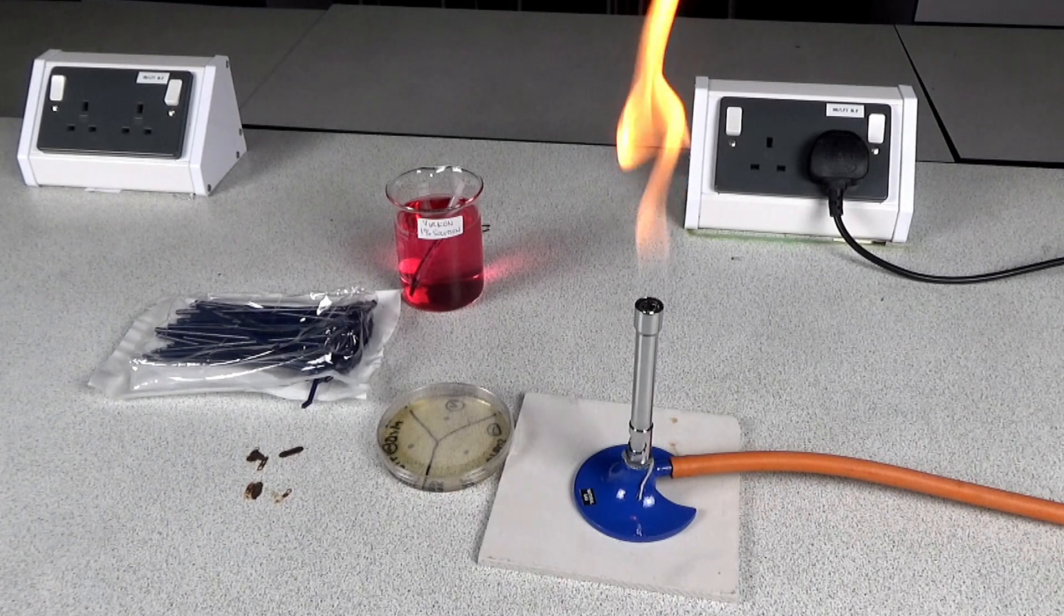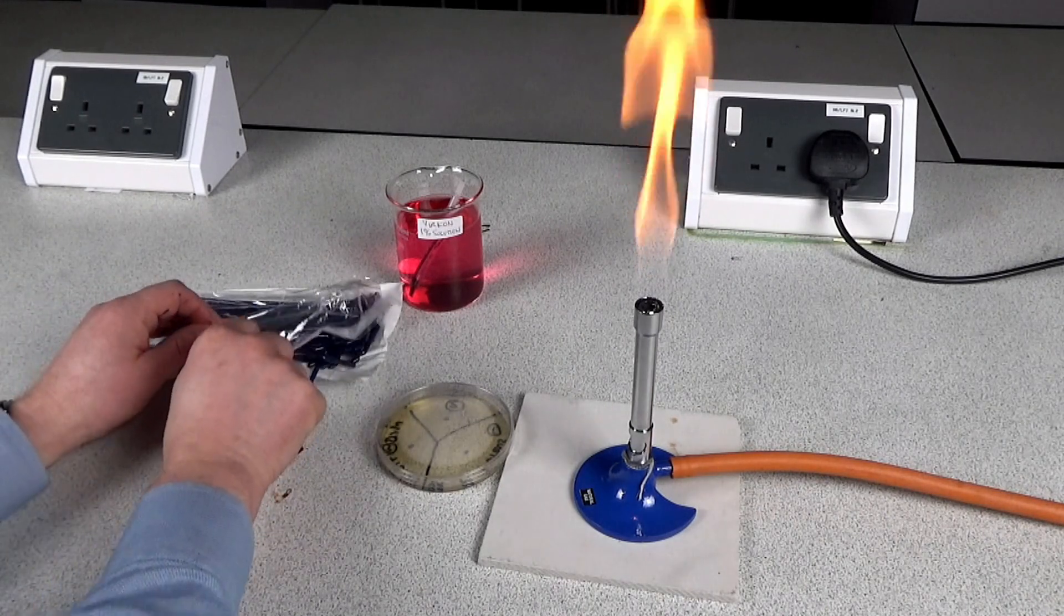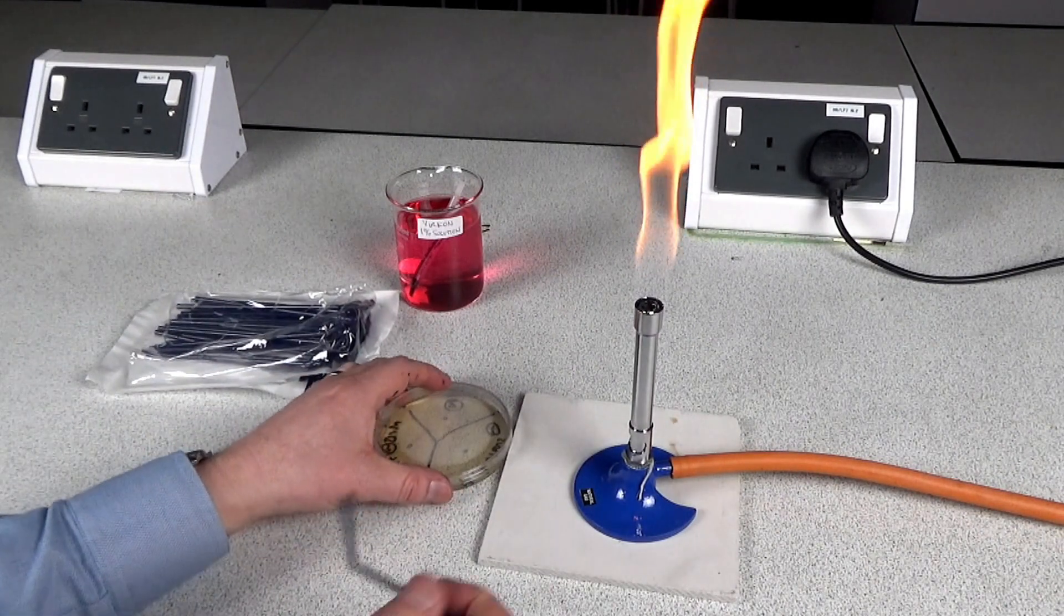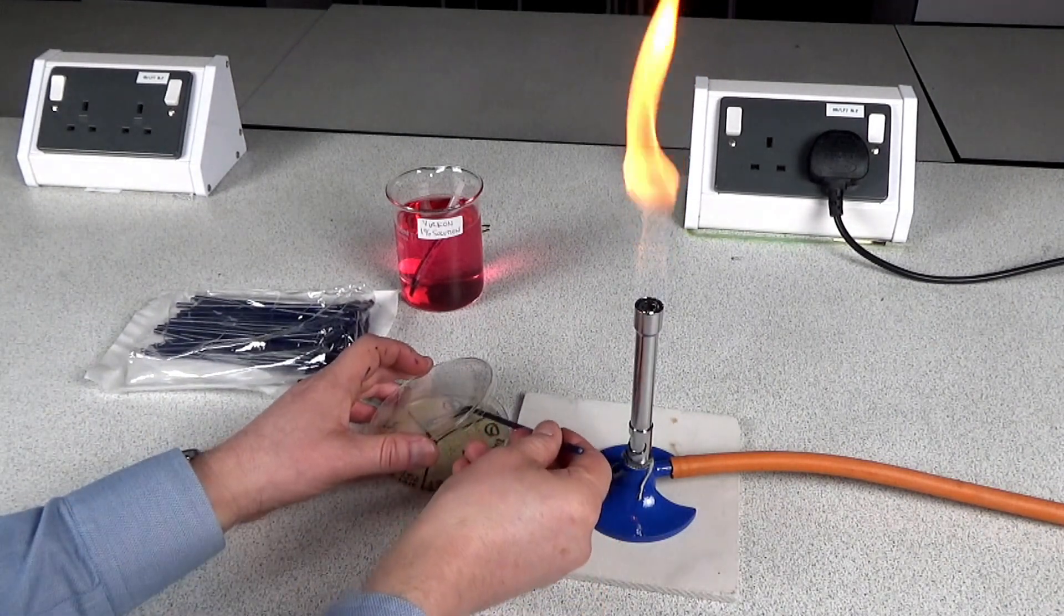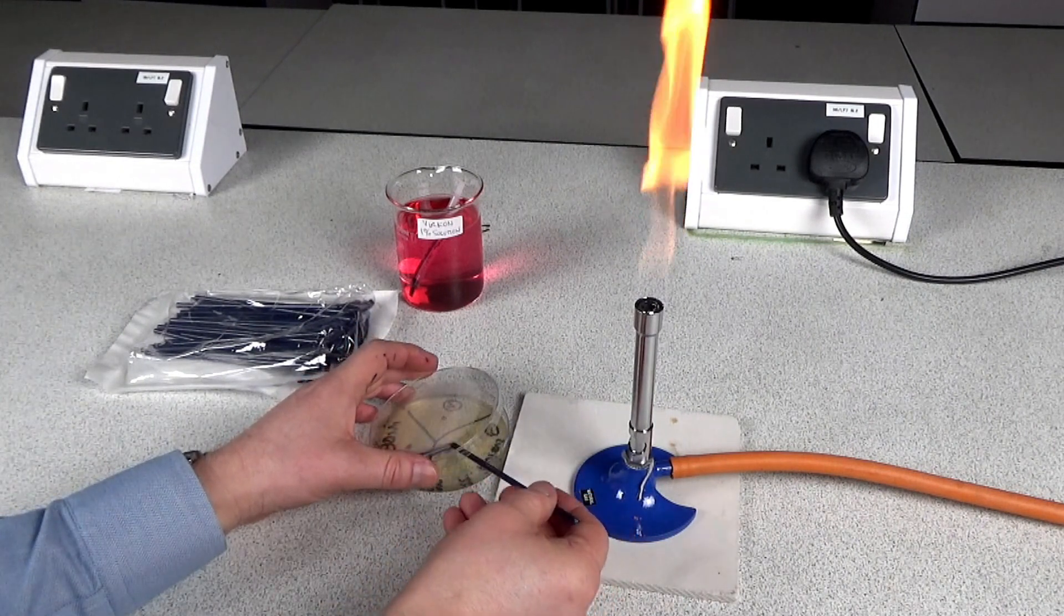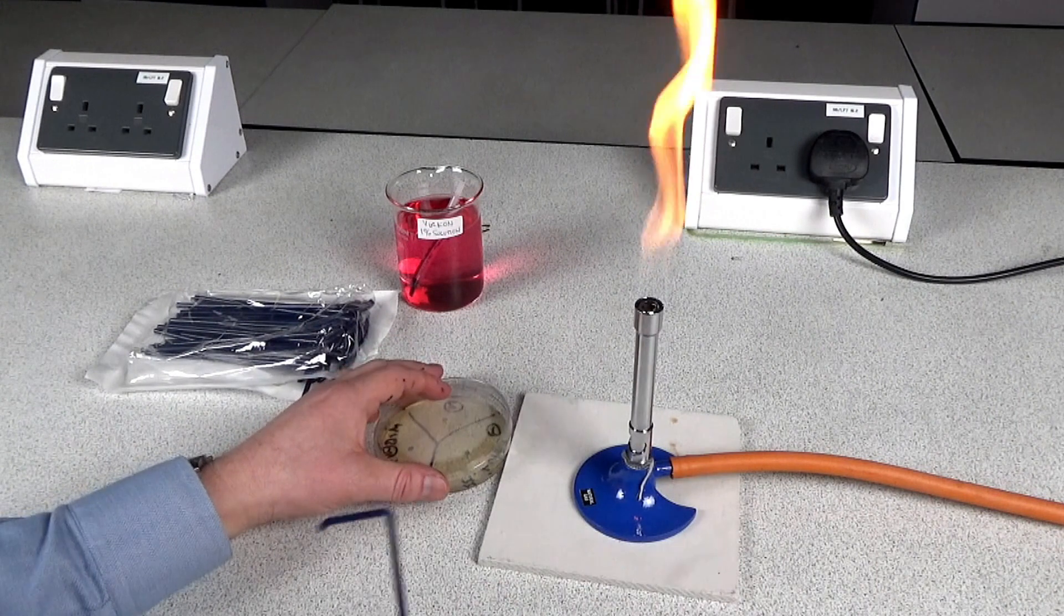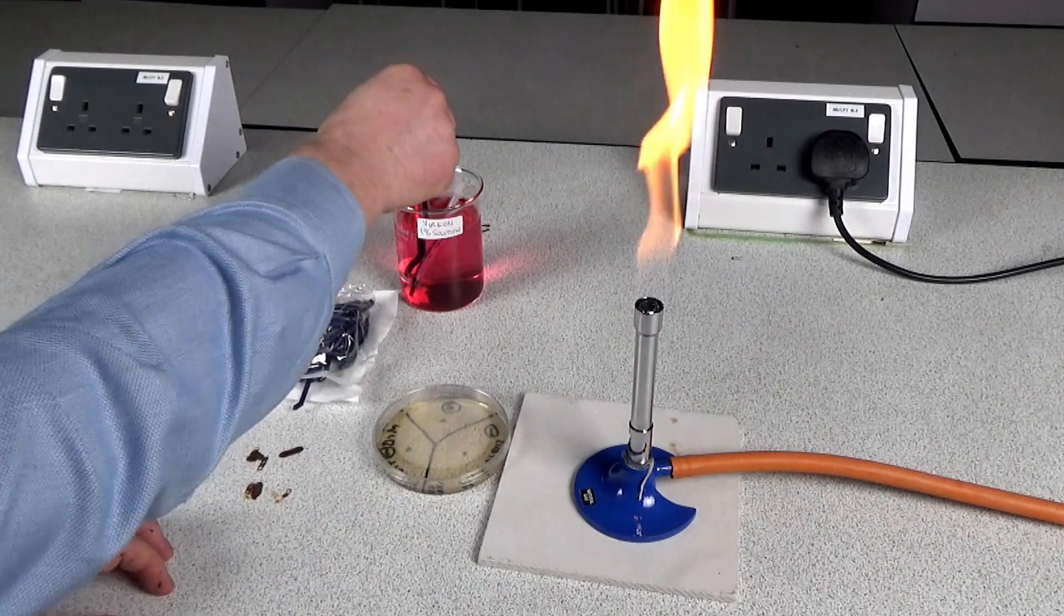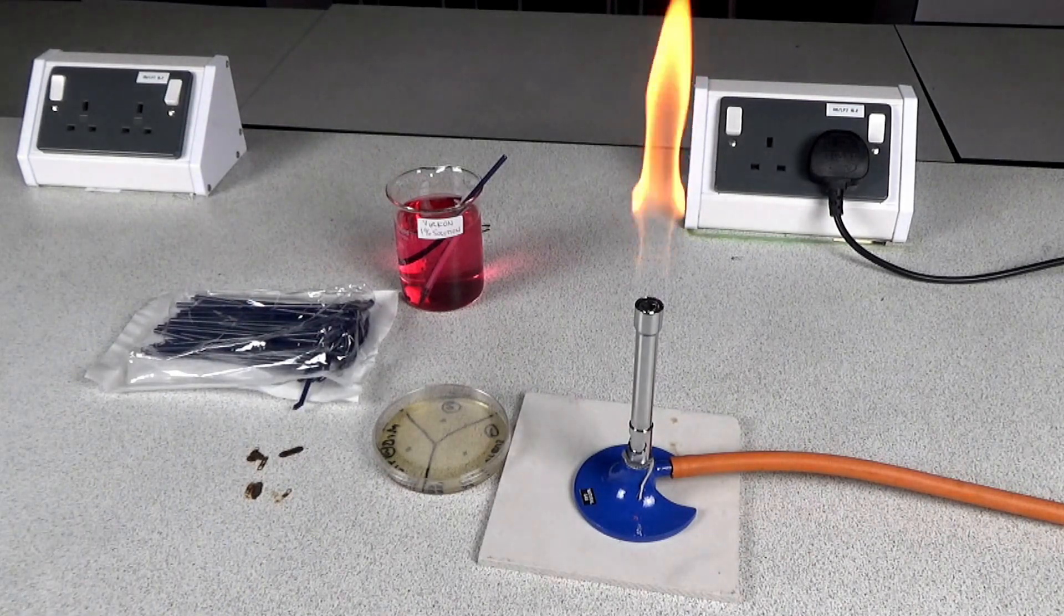Still working close to the Bunsen burner, your students then take one of the sterile L-shaped spreaders and they lift the lid of the petri dish slightly and they spread the bacterial culture that you've just placed onto the nutrient agar. The L-shaped spreader then goes into the pot of the vircon along with the syringe that's been used.